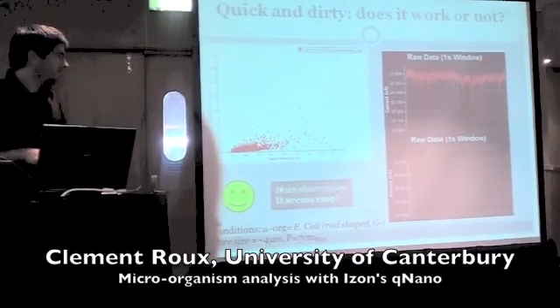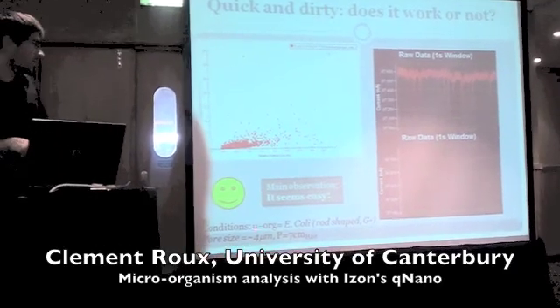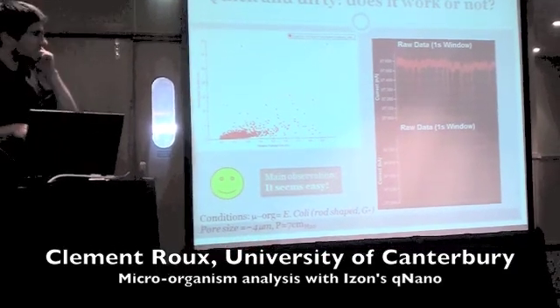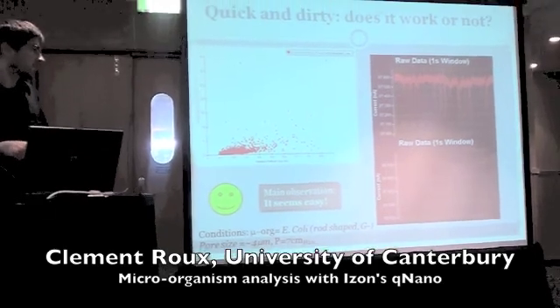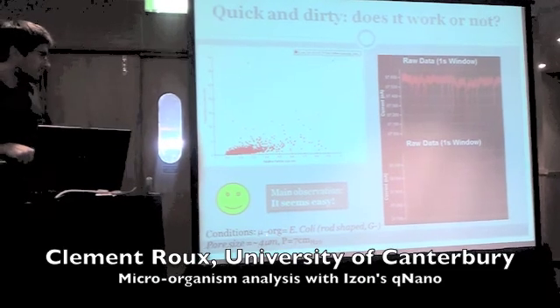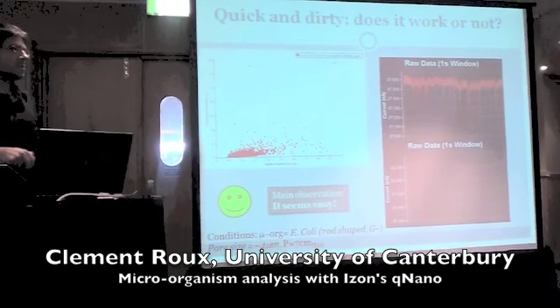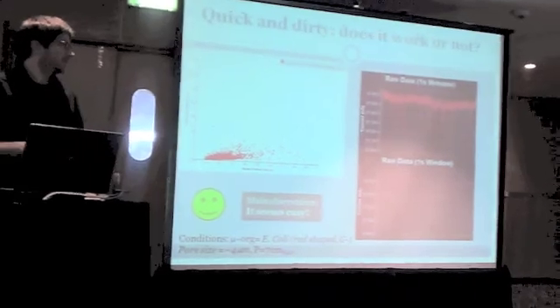So the main observation is seeing these. In this particular case, I was looking at E. coli, which is genetically modified in the mouse. That doesn't really matter. It's a rod-shaped, gram-negative bacteria. Pore size is about 4 microns, and E. coli is generally regarded as measuring about 2 microns in length, with the standards that you get with a qNano.